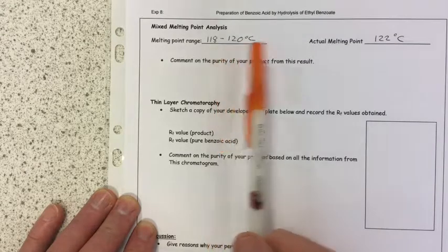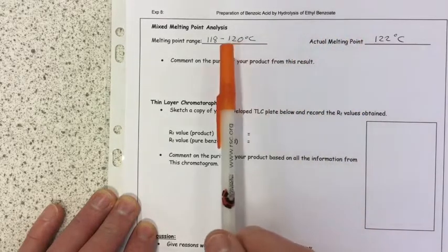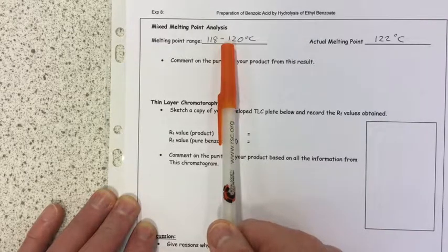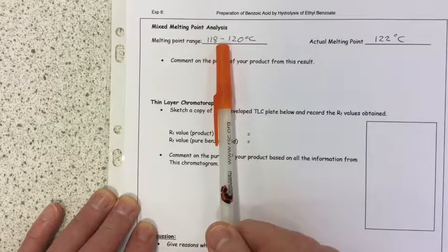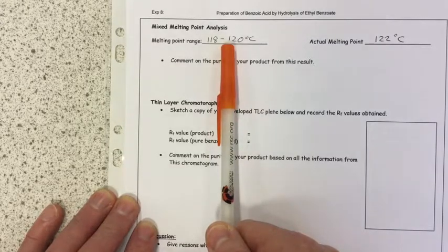The fact that I got identical results for the melting point and the mixed melting point analysis suggests I've got a very pure sample. The fact that it's a couple of degrees less than the actual melting point is probably due to the fact that I was heating the sample a little bit too quickly, so the reading on the thick-walled thermometer is a couple of degrees less than the temperature being experienced by the benzoic acid sample. So that slight depression in the melting point was probably due to bad technique — I should have been raising the temperature more slowly.